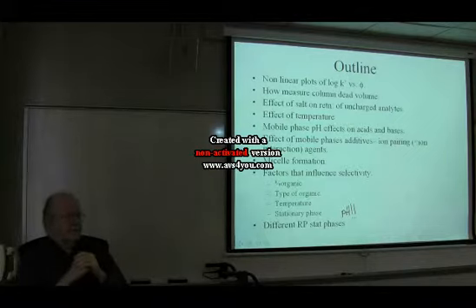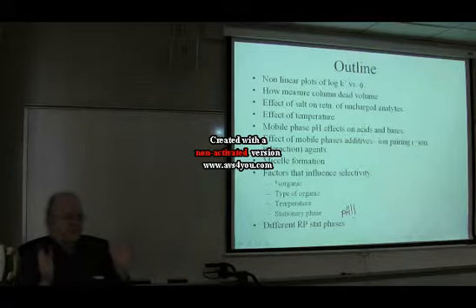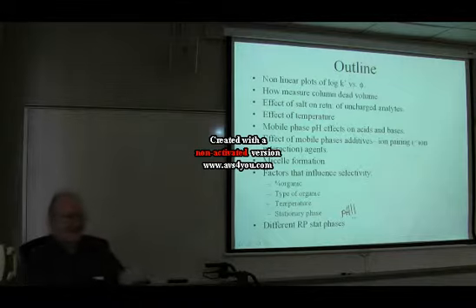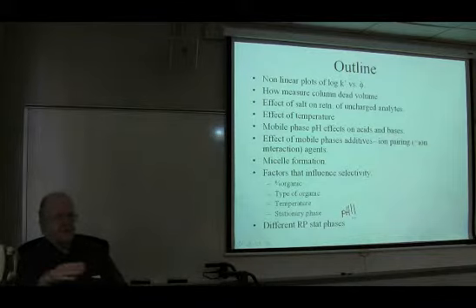For isopropanol, that maximum is quite high, on the order of 3 centipoise. It's 3 times the viscosity of water alone. That means that your pressure drop is going to be 3 times higher, and your maximum velocity is going to be 3 times lower. So the chromatography at that maximum point is going to be 3 times slower in an isopropanol mixture than in pure water. That is at the worst point in the isopropanol mixture.